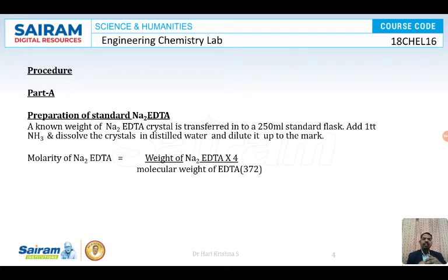What is a standard solution? When you're preparing a solution, if the weight of a solute and the volume of solvent in which it is dissolved is known, we can calculate the exact strength. Strength means normality or molarity of the solution. That is called a standard solution.